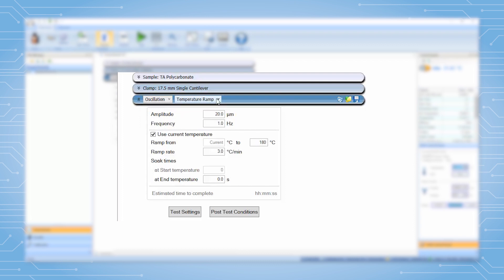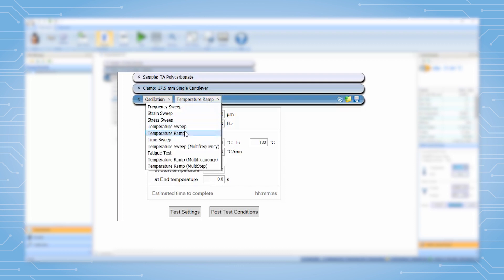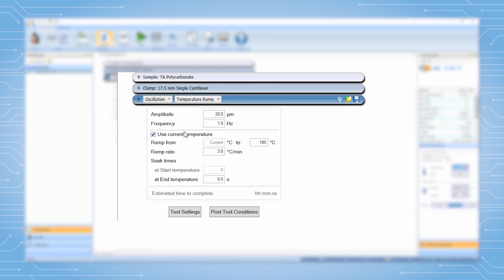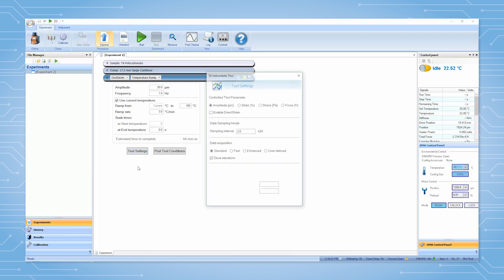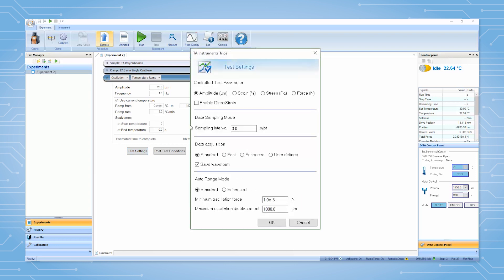The following is a typical starting point for reasonable parameters. Your experiment may require customization depending on the sample clamp and temperature ranges. Under test settings you can select the following options.